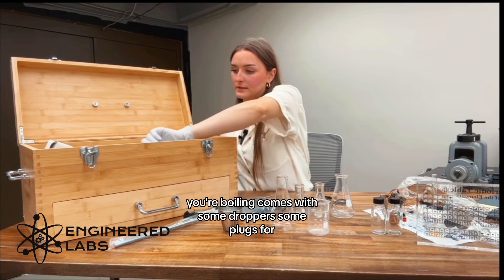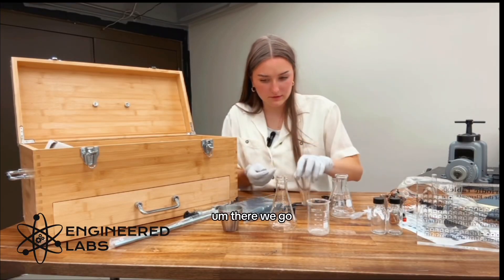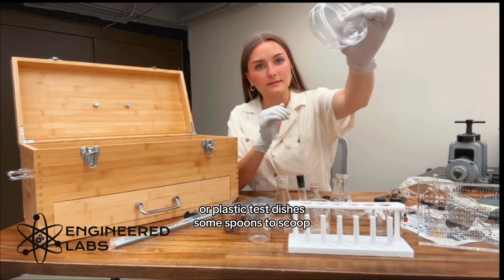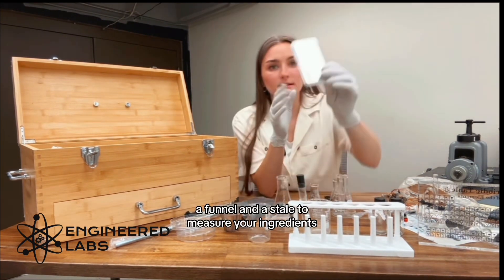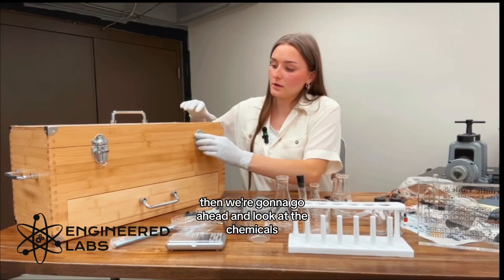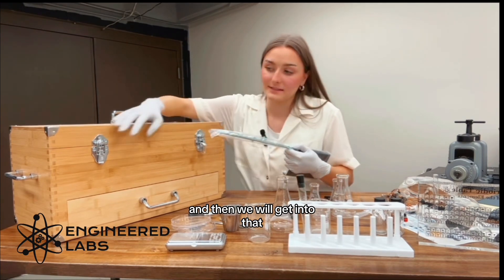Your boiling flask comes with some droppers, some plugs for your beakers, this little thing to hold all your little things, plastic test dishes, some spoons to scoop, a funnel, a scale to measure your ingredients, and a stir rod to stir your chemicals together. Okay, then we're going to go ahead and look at the chemicals. I'm going to put all this away first and then we will get into that.